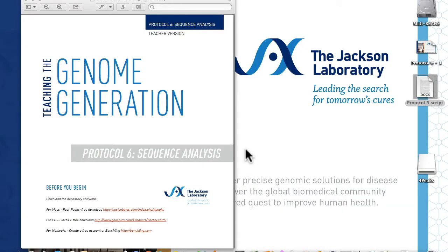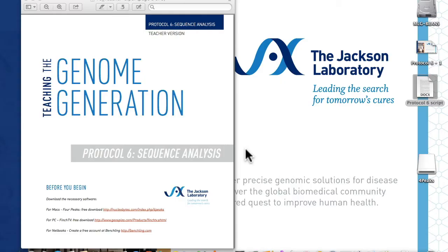Before you begin, download the sequence viewing software appropriate for your computing system. In this example, I am using a Mac, so we have recommended using a Mac-based program called 4Peaks. Check the protocol for our suggestions for PC, tablets, and netbooks, and consult your IT department for your institution's installation procedures.